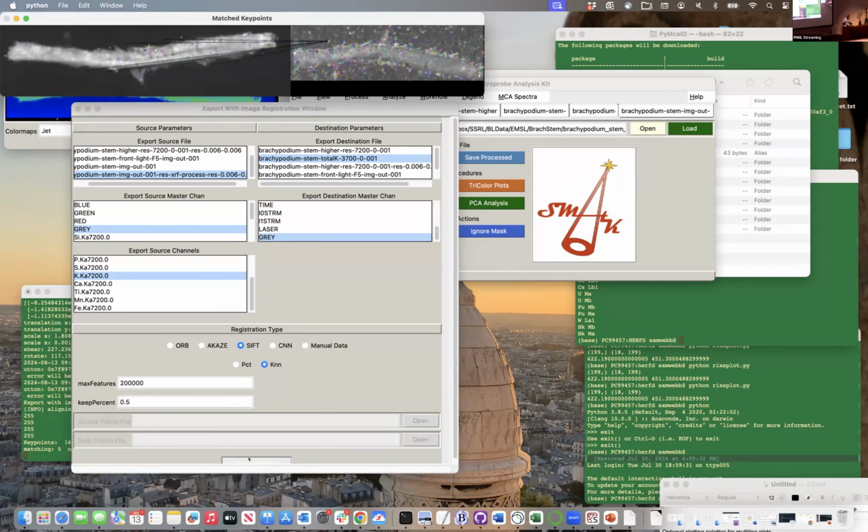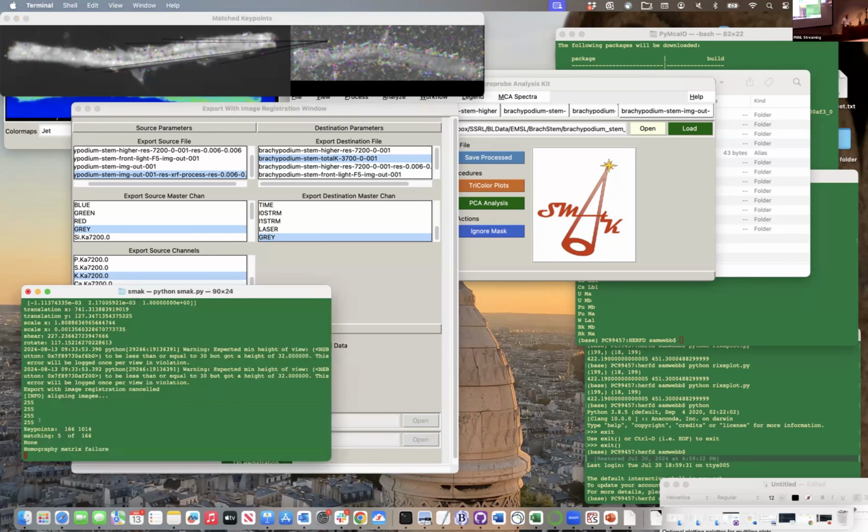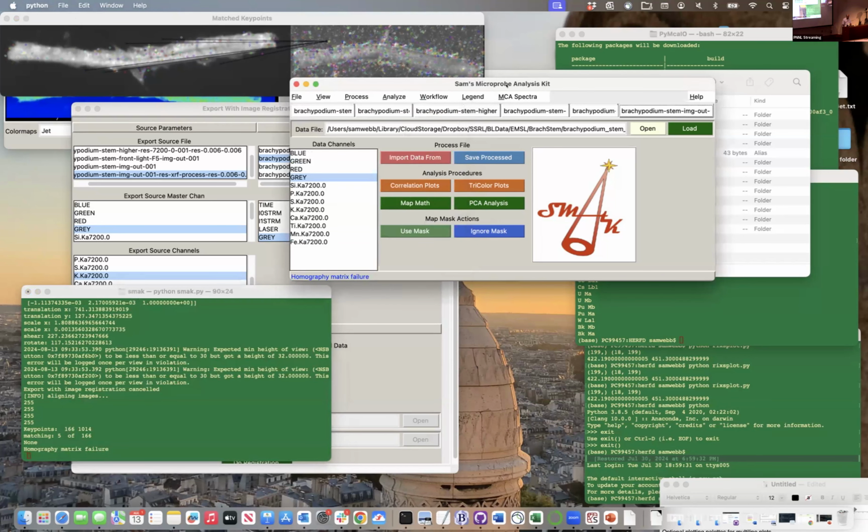It really did a really good job of removing all those bad matches, but now they all match on the same one point. And it's going to say at the bottom here, matrix failure, because it only had 4 or 5 points, and you actually can't solve the transformation matrix with only 4 or 5 points. So it did a much more aggressive removal than we would have liked.